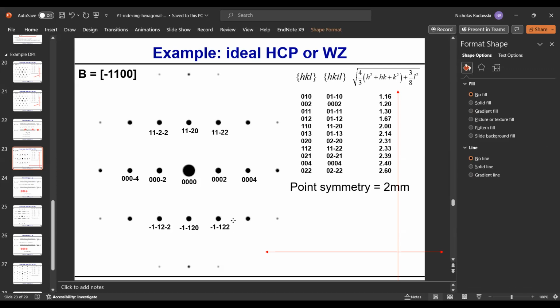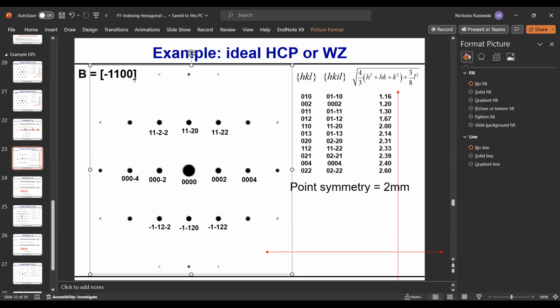Now, one thing I didn't do in the last pattern, and I should have: with the Weiss zone axis law, I should get a 0 dot product between this and all of these if I did this correctly. Just by inspecting, this does look valid. These are obviously all good right here. These two are also good, because you have zeros here, and then you have the 1 and the 1 bar and the 1. Everything else is the same. These are all spots in the 0 order Laue zone, so you should get a 0 dot product between B and G for all of these.